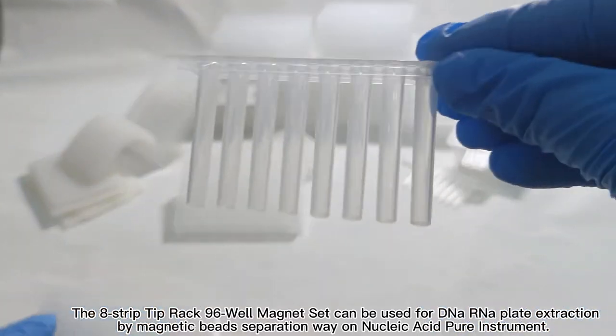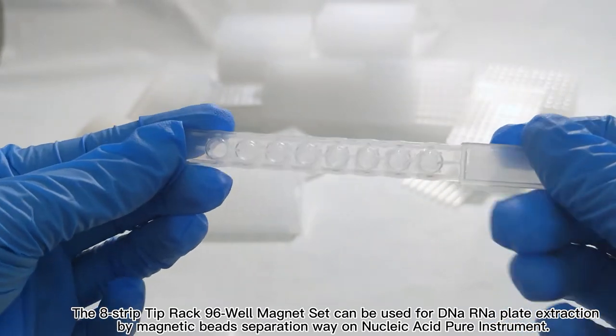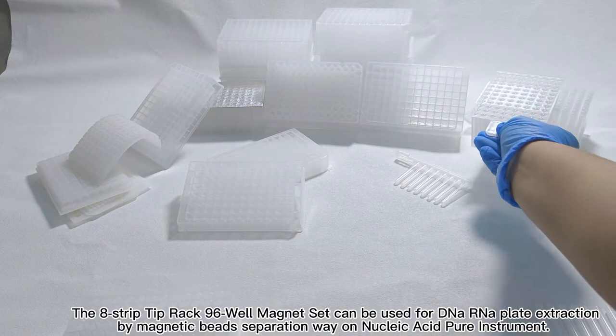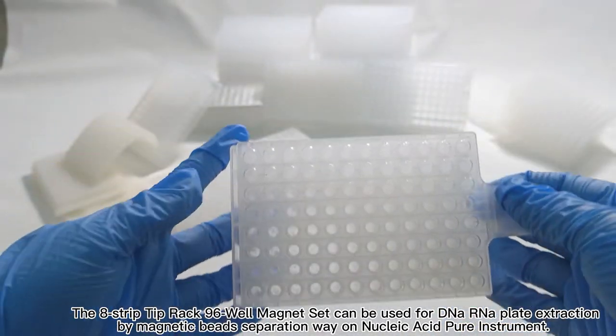The 8-strip tip rack 96-well magnet set can be used for DNA and RNA plate extraction by magnetic bead separation with a nucleic acid purification instrument.